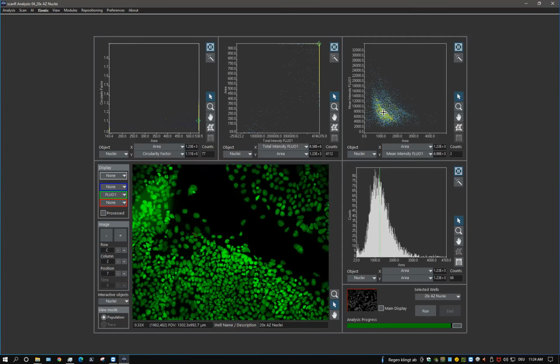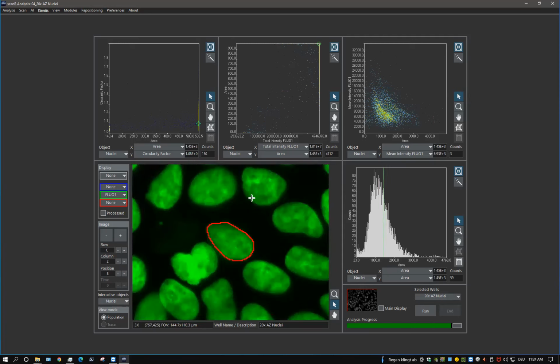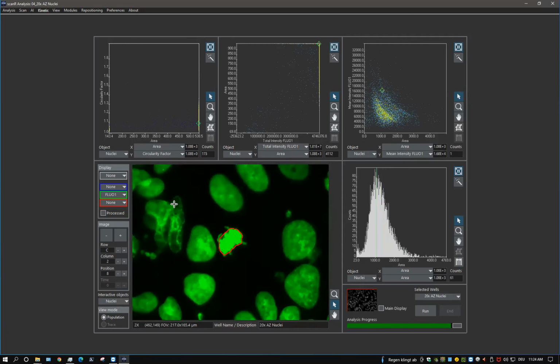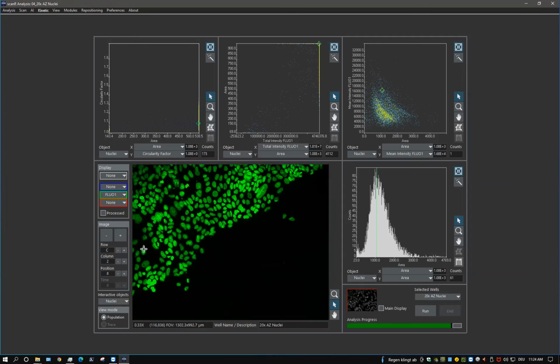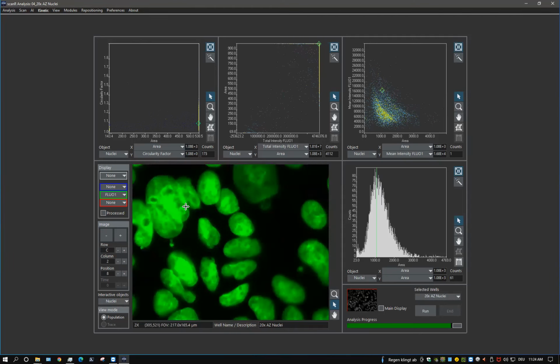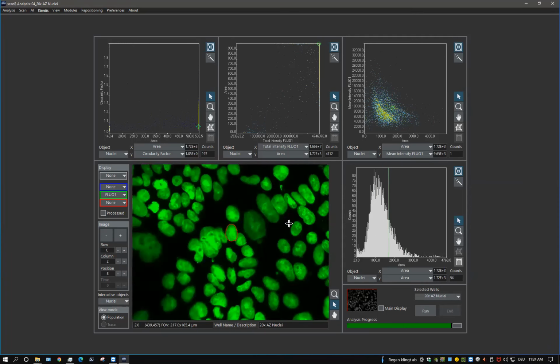So what it basically does is a very decent job. So I can see here that the nuclei are detected well, even strangely shaped nuclei in some kind of meta state are visible here. Let's go to something where it's very difficult. So here there is no obvious solution because there's overlap. Let's see what the network detected here. So basically it excluded them, that makes sense.